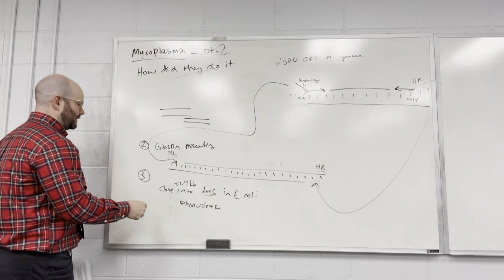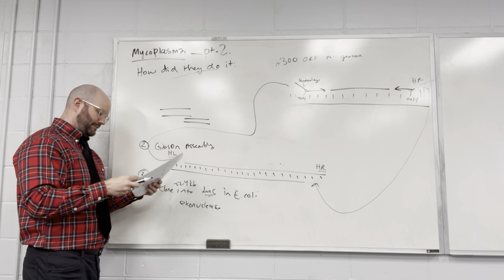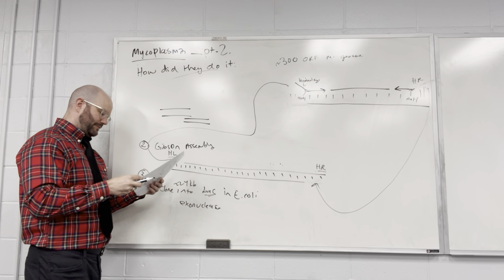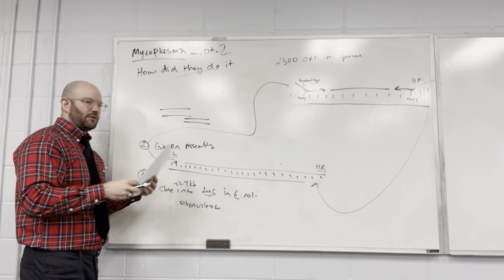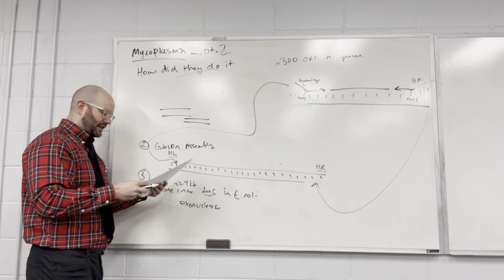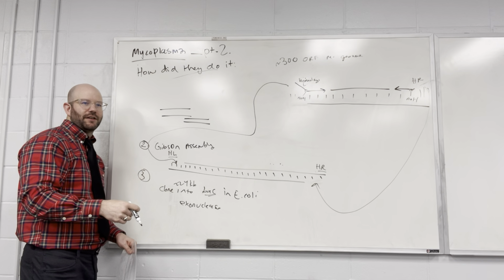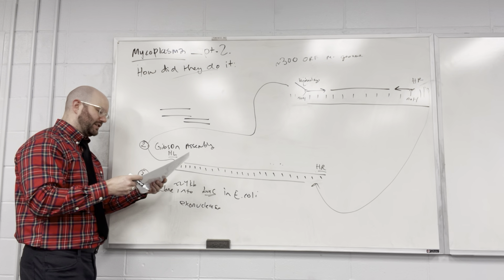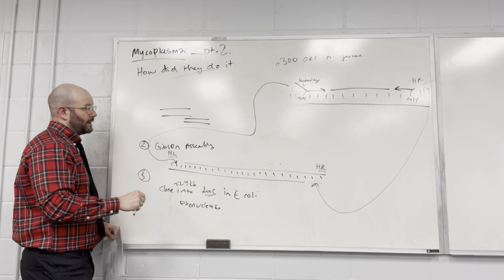Okay. What are the numbers 67 and 68 on figure C? What do those numbers mean? Are those primes? Those are just sequences. I think those are like 66, 67, 68, 69. I think those are just segments of the genome. I think it's an example. Yeah, they're paired together in 4, and they just use it as an example.